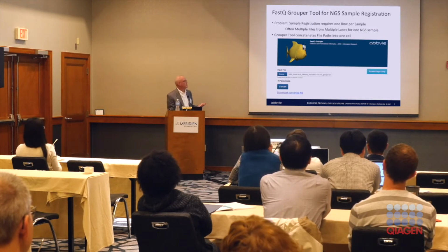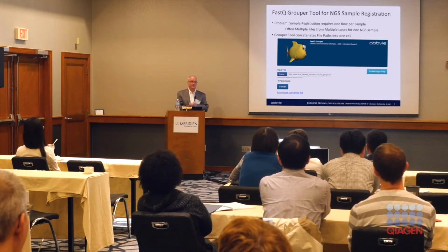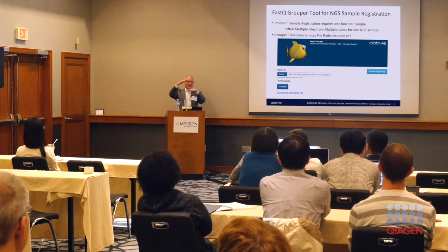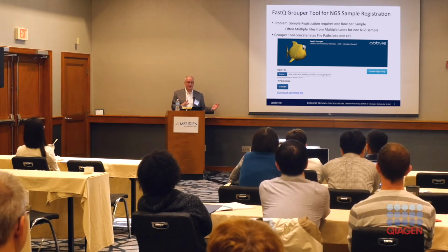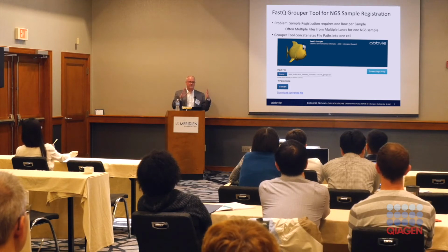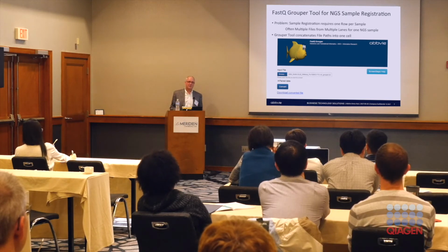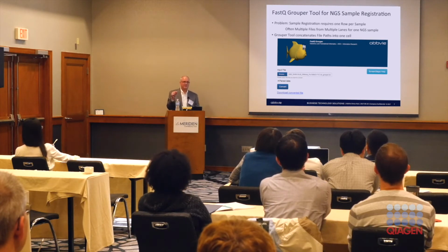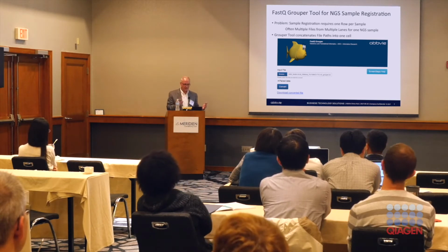Another thing is the problem of sample registration. Now, we just learned yesterday the magnificent tool from Joe of how you can take a design table and propagate that through an analysis to all the other counts. We didn't have that, and certainly that's tedious. So it was important for us to actually have the metadata with the NGS data initially, so that it came through everywhere. But then the problem with this, how do you register samples? Because it's one line per sample, but we may have 18 FASTQ files for that sample. So you need to have that organized, grouped, and concatenated into one cell.